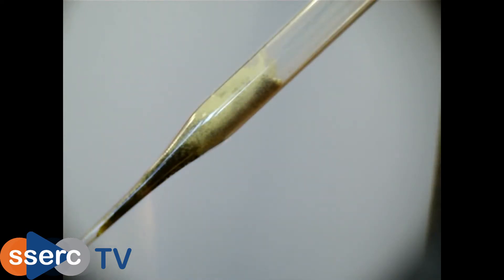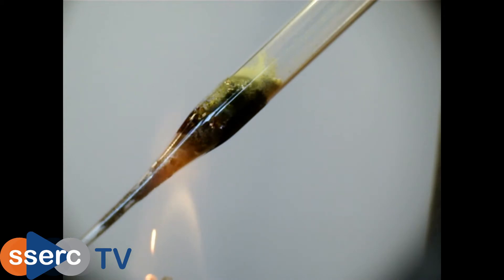We now heat it and we're just using a small spirit burner here. The first thing you see is the sulfur melting and going a dark red. This is purely a physical change. You can also see sulfur vapor above the mixture.